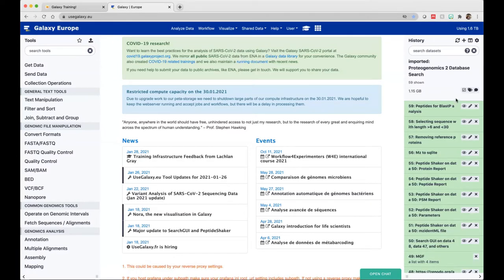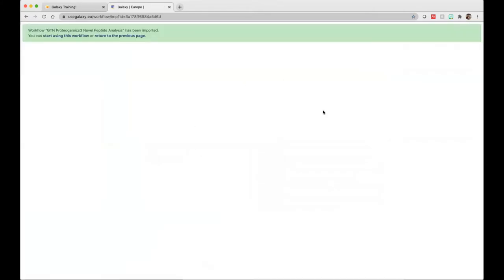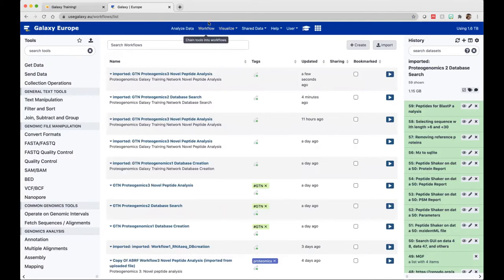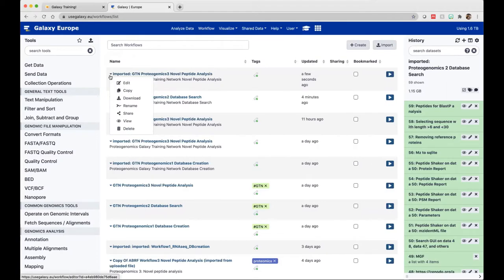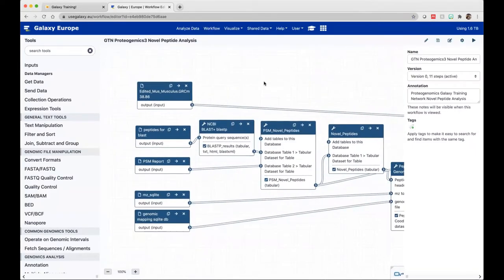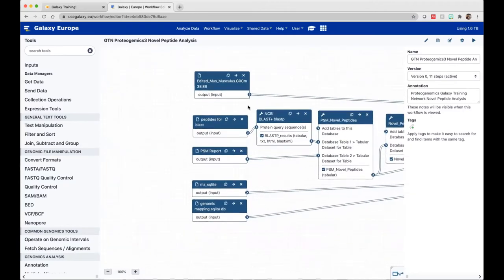The next thing we do is extract the workflow. Go to shared data, go to workflows, and search for the GTN Proteogenomics 3 novel peptide analysis. If you click on the dropdown, you can import it, or you can directly run it. Click on 'start using this workflow.' The workflow you have just imported is now in your workflow tab. Click on the dropdown and select edit to view the workflow.